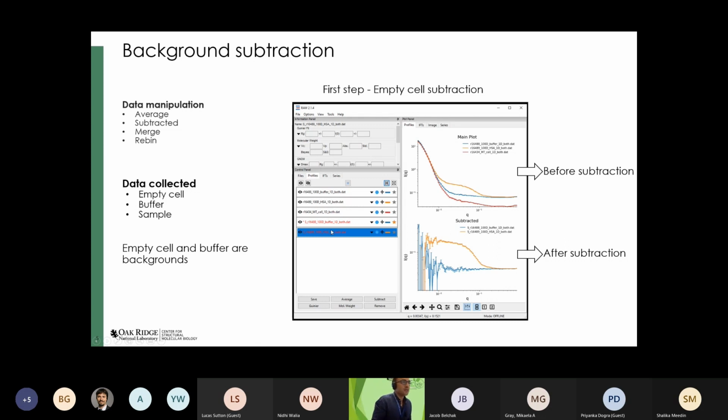The way that we do the experiments, in general we do the calibrations first, and then for proteins we have some standard configurations, like Venk said yesterday, which are already calibrated and which you can use to do the experiment. And in this case, this sample was collected using 1.5 meters, 6 angstroms.